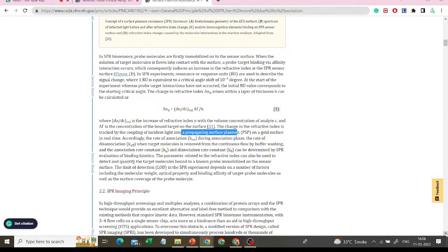So you know that SPR majorly involves identifying the rate constants, that is the association rate constant, which means the binding kinetics. You can measure the binding kinetics, that is how strongly your drug can interact with that particular protein in SPR. That means your drug has so much affinity towards that particular protein, and you are very sure that if you target those proteins with that particular drug, it gets associated very quickly and it is difficult to dissociate. So you will get the binding rate.